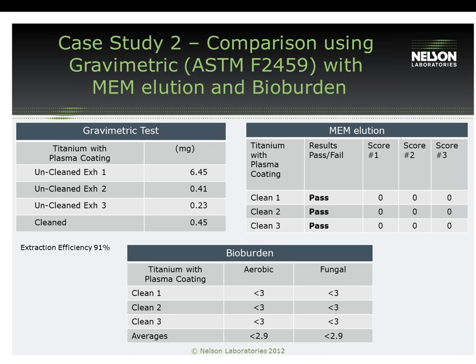But again, as we talked about at the beginning, you can't just test for cytotoxicity or bioburden as part of the sterilization validation, because just because it's non-cytotoxic and it's sterile doesn't mean it's clean. That's why it's really important to quantify how much is there and that it's a safe and acceptable amount. And so that's why these tests are important.